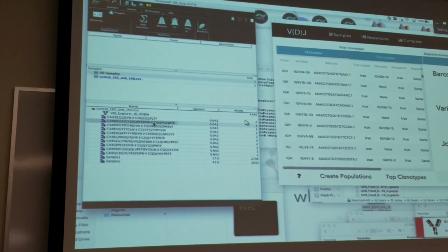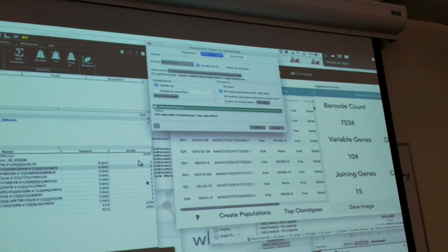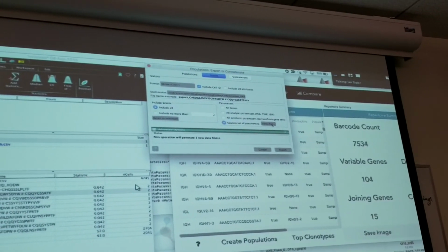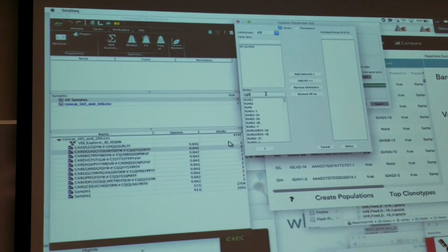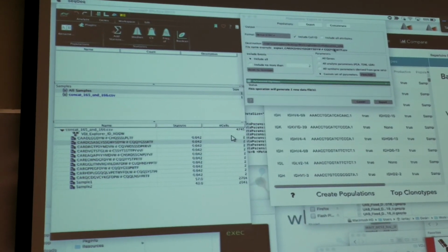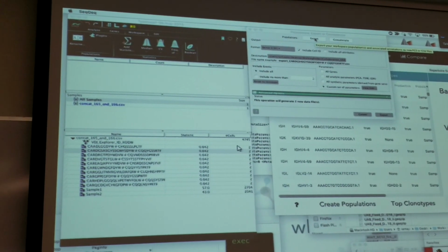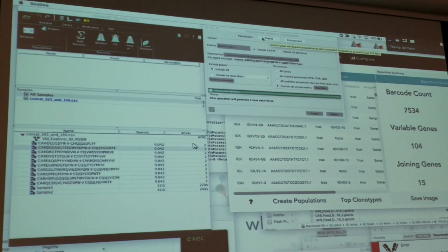So if you were interested in this particular pair of cells, I can right-click, export, and maybe I'm not interested in much else besides the sample ID. Maybe I want to know a couple of genes. I could select this one. Now I'm only going to export 2 genes for 2 cells. We'd expect to get like a 4x4, a 3x2, or 3x3. You'll have some annotations at the top as well as the cell ID.